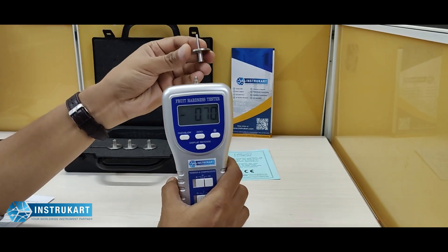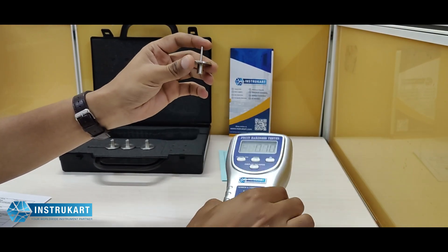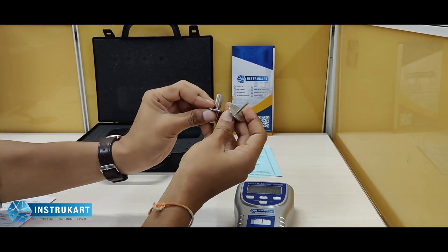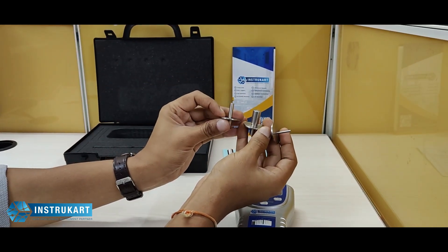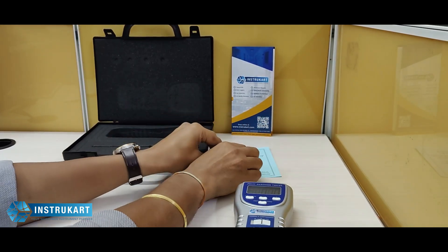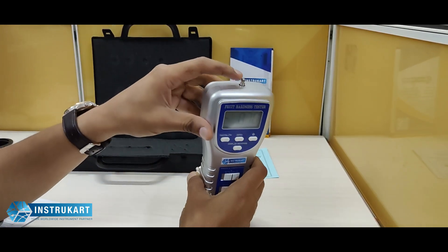As a standard accessory, we have different penetrometers of different diameters, as you can see. Based on the fruit type, we can use the appropriate penetrometer. These come as a standard accessory and can be fitted on the top.